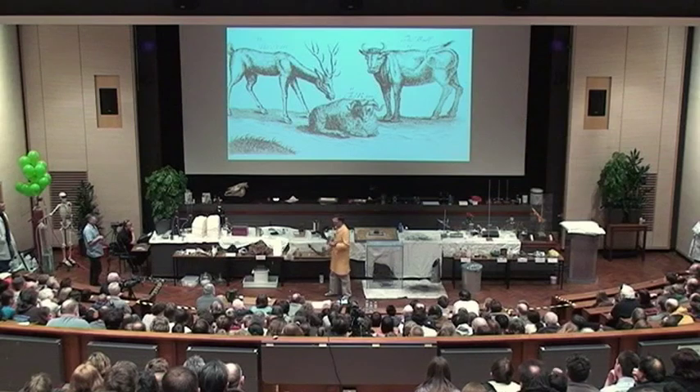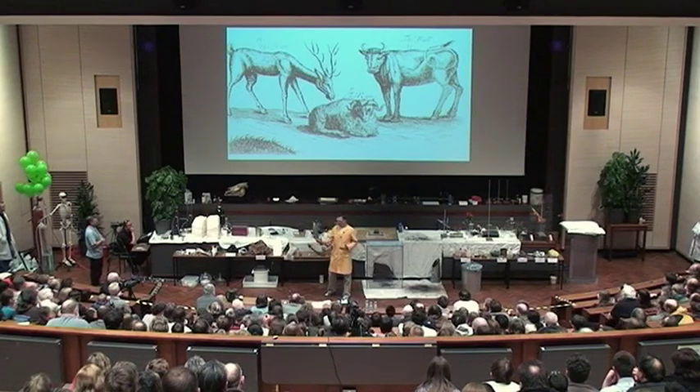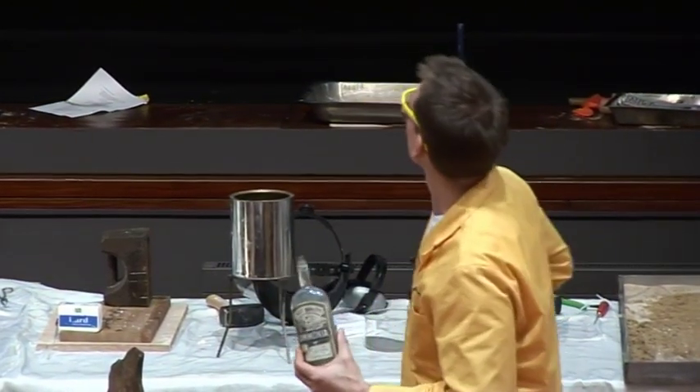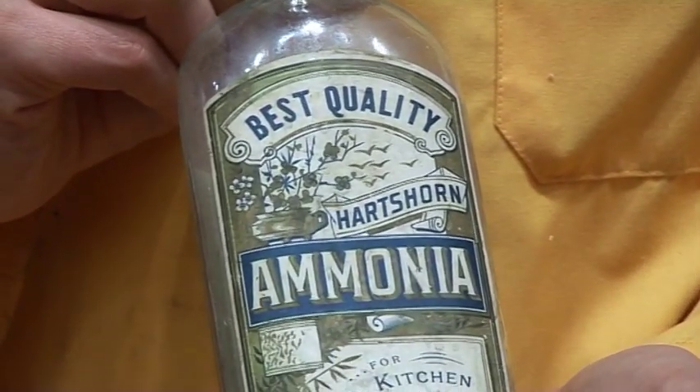We tried this — we heated this up — and what you get out of this, they used to call it spirit of hart's horn, because that's what you started from, some hart's horn. In fact, this bottle that I have here is quite an old bottle, and it says 'best quality hart's horn ammonia.' So this was entirely natural-ish, if you think distilling antlers is natural.